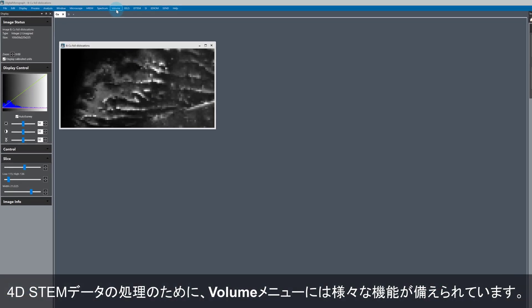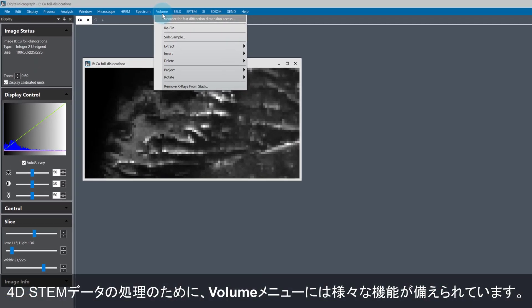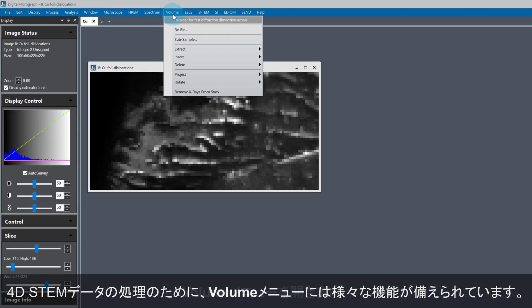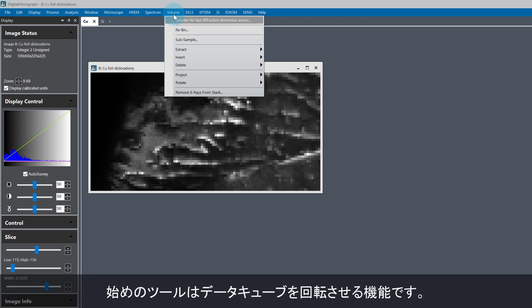Another set of tools available for 4D STEM data processing is contained in the volume menu. The first important function in the volume menu allows us to rotate the data cube.